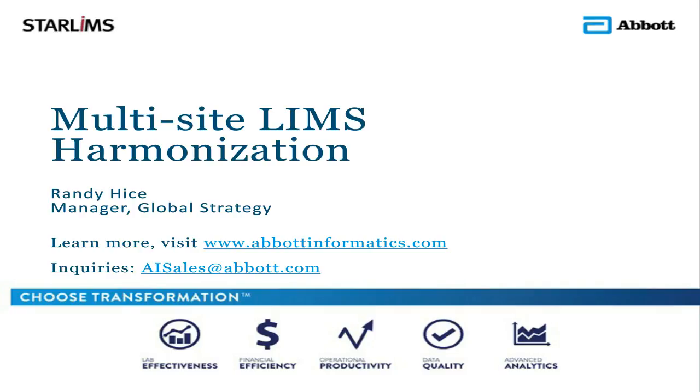That probably doesn't include validation, because in validated environments, validation is like stereo equipment or whatever. You can spend as much money and time on validation as you want to. Companies that are more risk adverse will have greater validation needs and more stringent validation requirements. Sometimes that can consume a third of the project time and budget. In other cases, validation is much easier, or some companies are not in environments where they actually validate at all. So validation can add a third of the time to those figures I mentioned, or if there's no validation, you're probably at the lower end of that implementation curve.